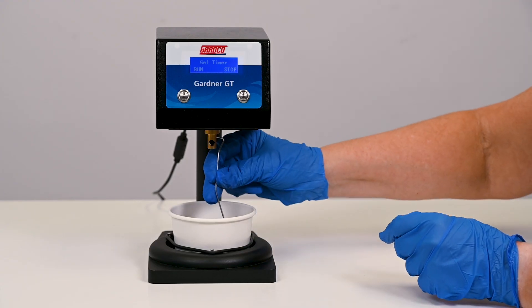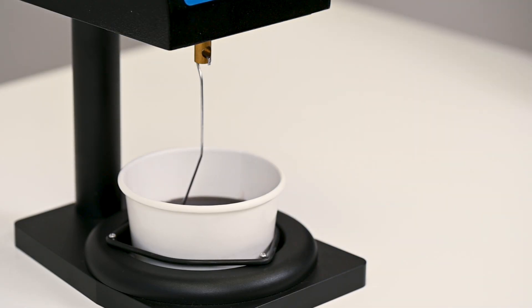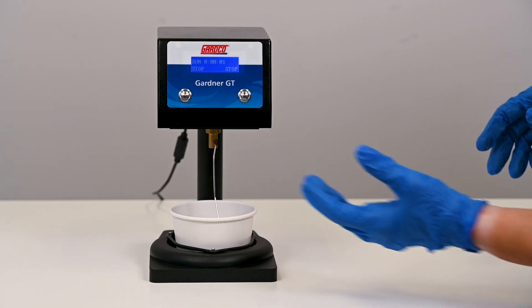Insert the wire stirrer down into your sample and hook it through the hole on the head of the gel timer. Press the run button and the timer will begin counting.